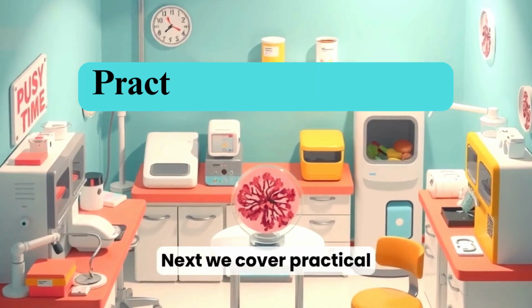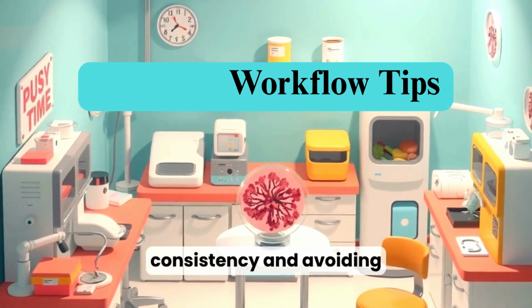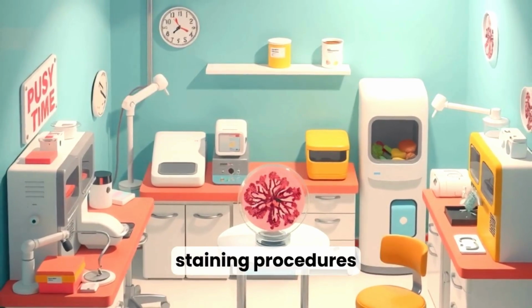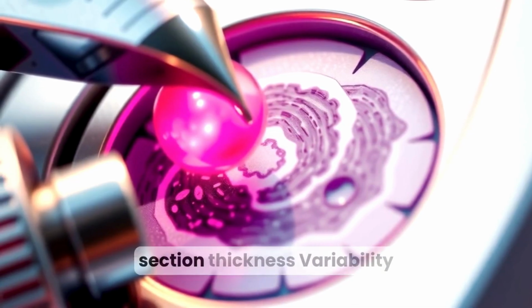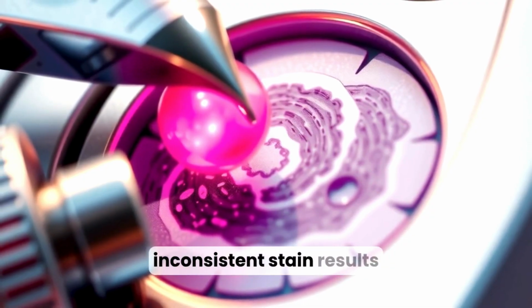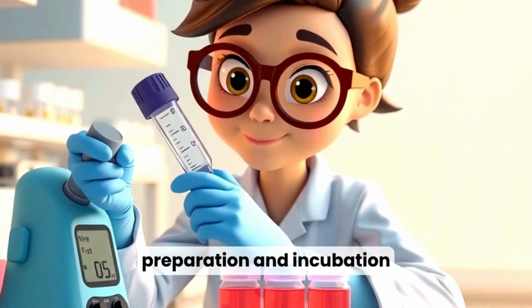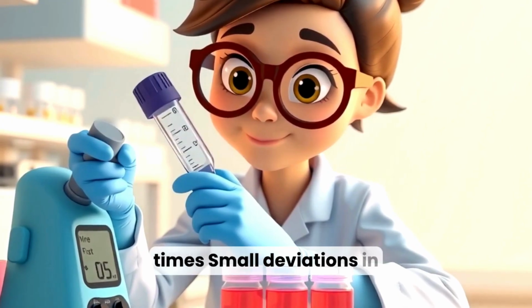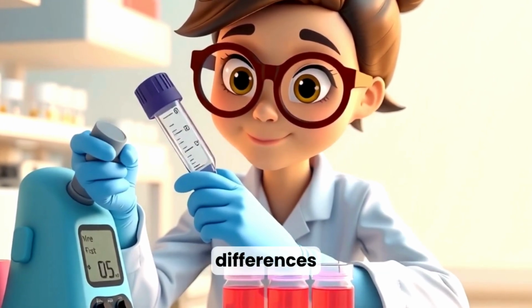Next, we cover practical workflow tips for laboratory preparation, staining consistency, and avoiding common pitfalls during special staining procedures. Start with high-quality fixation and consistent section thickness. Variability here is the major source of inconsistent stain results. Standardize reagent preparation and incubation times. Small deviations in concentration or timing often produce large color differences.